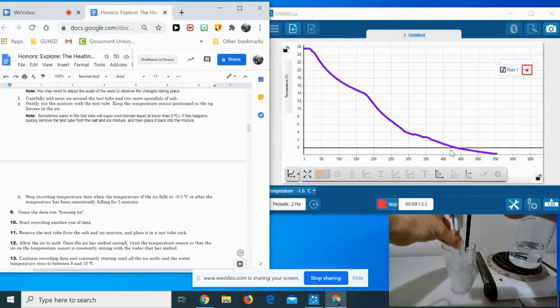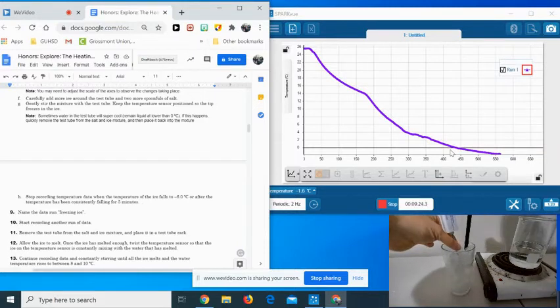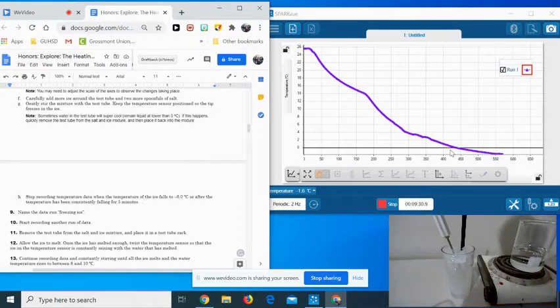So when I have my thermometer right here, I still have water there, okay? So I don't have frozen water. I don't have ice. I just have really, really cold water, okay? So we're going to keep running this, and I'm going to keep adding ice. A little bit of ice and a little bit of salt at a time.